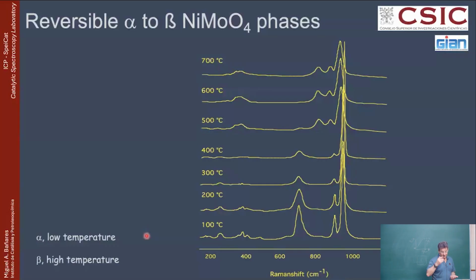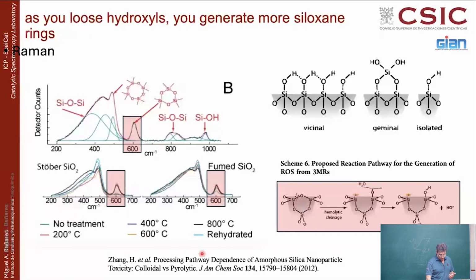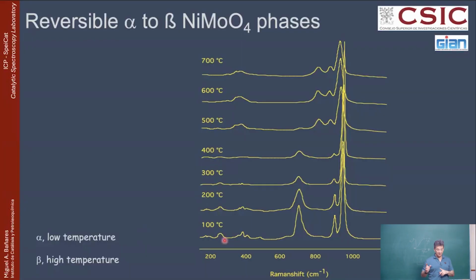So this is interesting. You can also look at reversible changes. Changes are not necessarily irreversible. If you dehydrate the silica and then try to rehydrate it, you restore it, but only partially. But you can also have a completely reversible system.